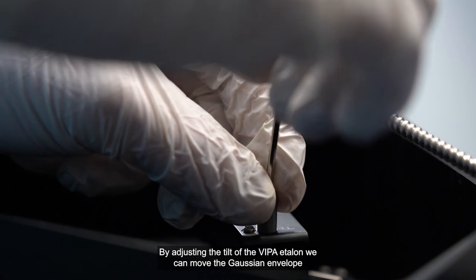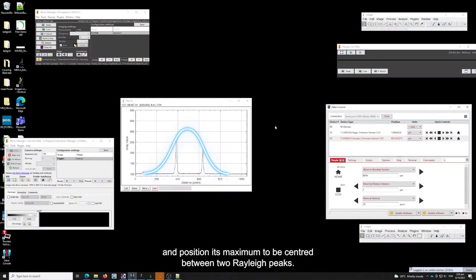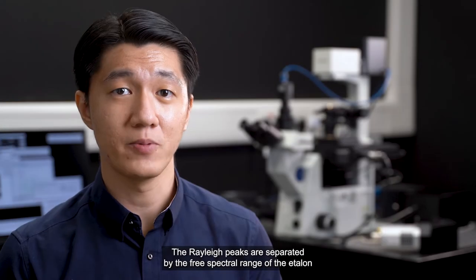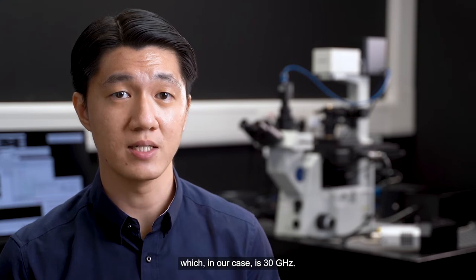By adjusting the tilt of the VIPA etalon, we can move the Gaussian envelope and position its maximum to be centered between two Rayleigh peaks. The Rayleigh peaks are separated by the free spectral range of the etalon, which in our case is 30 gigahertz.